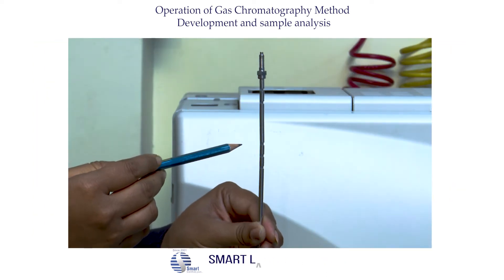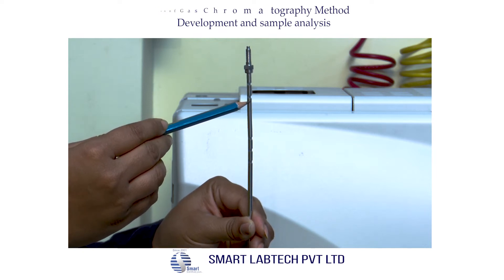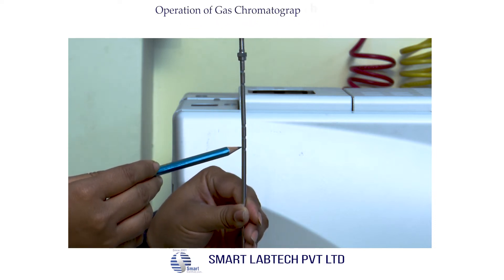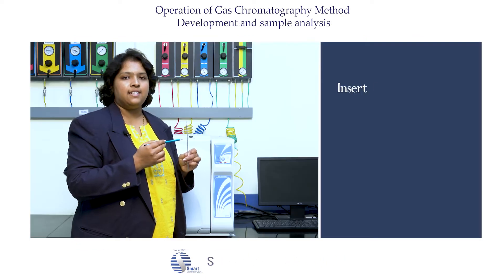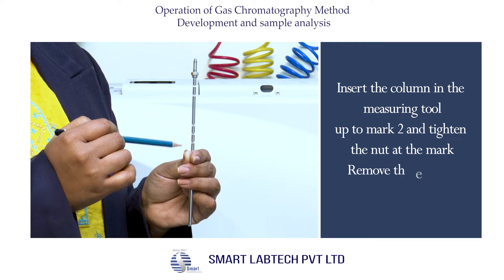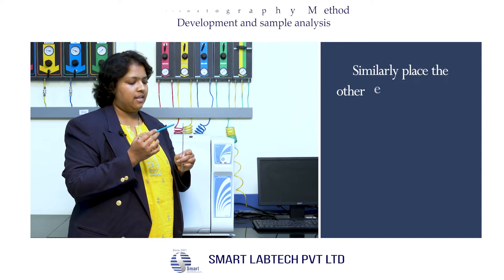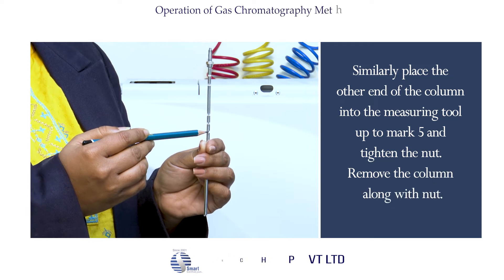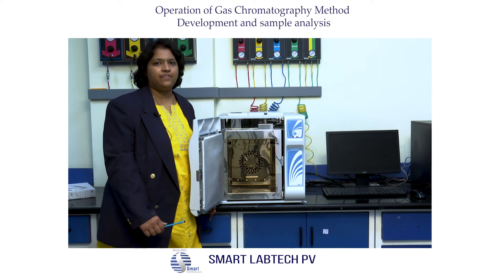This is the column measuring tool. The mark for 2 indicates a 43 mm distance to be maintained for the 99 mm liner on the injector side. The mark for 5 indicates a 98 mm distance to be maintained at the detector side. Insert one end of the column into the measuring tool up to mark 2, tighten the nut, and remove the column with the nut. Similarly, insert the other end up to mark 5, tighten the nut, and remove. Now let us fix the column inside the oven.